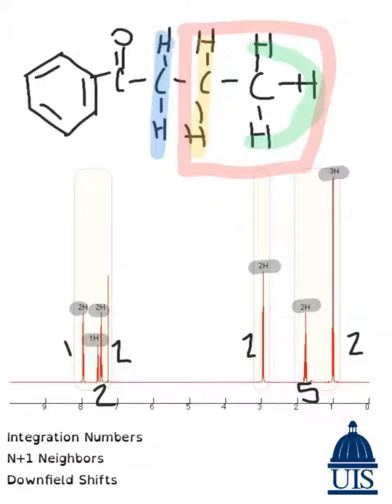In addition, the proton NMR chart that showed where things shift actually showed that we probably were going to have a ketone, which is what we ended up having. And we knew this because we saw that a ketone would probably show up around this 2 range in our proton NMR spectra.